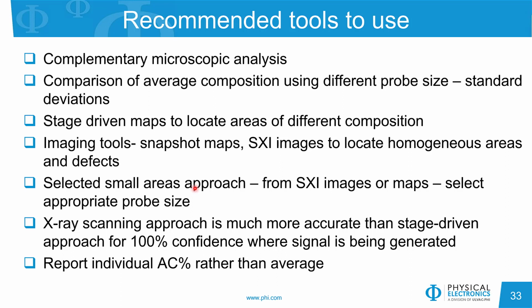And remember that averages don't always tell the story. Report individual atomic concentration from different selected areas to capture the differences in chemistries if the sample is heterogeneous.